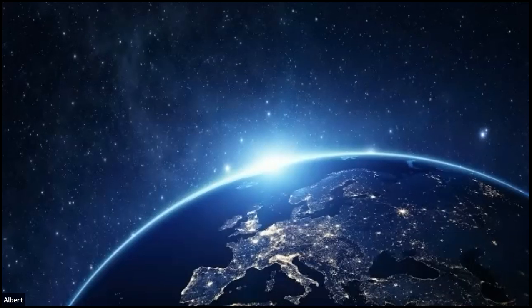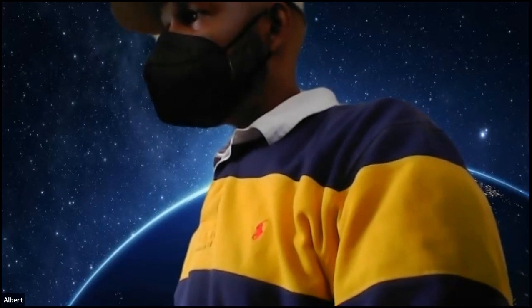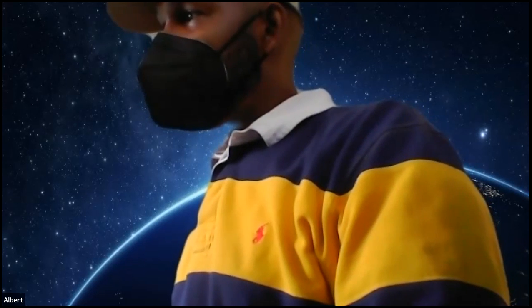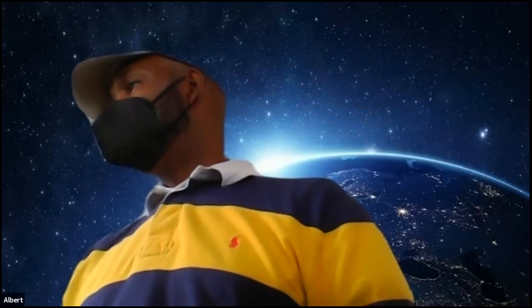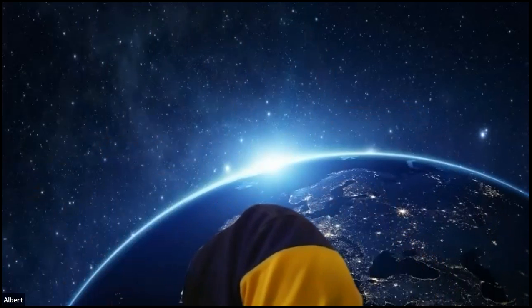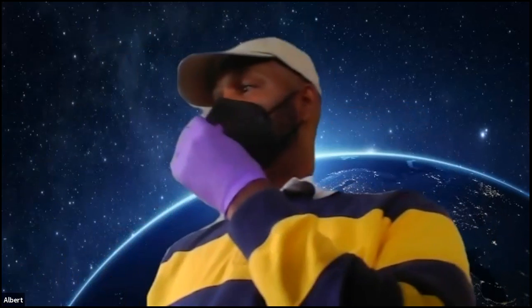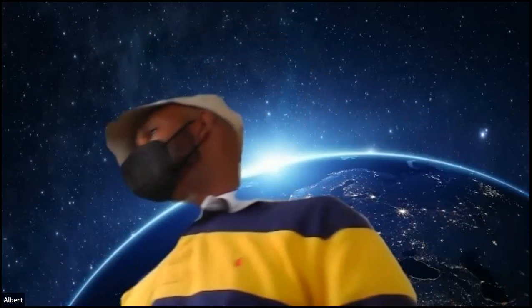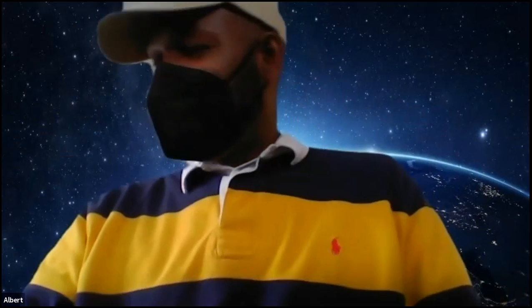All right. Add some more because it's still not dissolved. Go ahead. I'll tell you when to stop. All right, that's good. Now sit that on the hot plate and swirl it. You're going to have to add more. That's still not enough. All right, there you go. Now swirl it and keep it hot and keep your ethanol somewhere. Might not be enough room. Just have to swirl in smaller circles, if that makes sense.